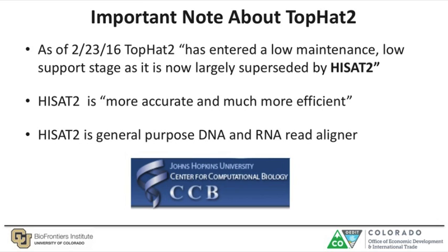Now, before you run off to use HiSat2, know that it is still in beta testing, and TopHat 2 will of course still serve as an excellent tool for spliced read alignment. But I wanted to bring this to your attention so that you may incorporate HiSat2 into your analysis pipelines in the future.